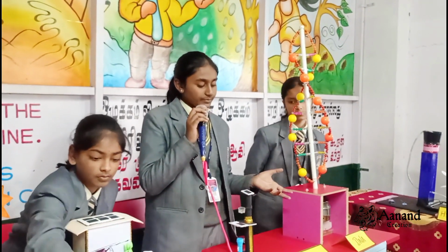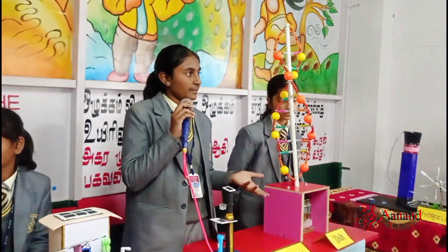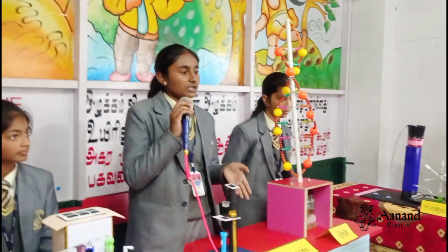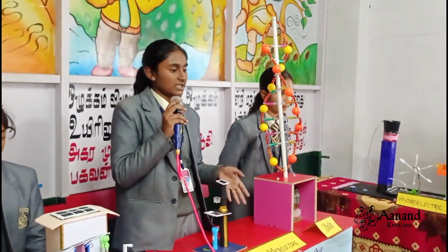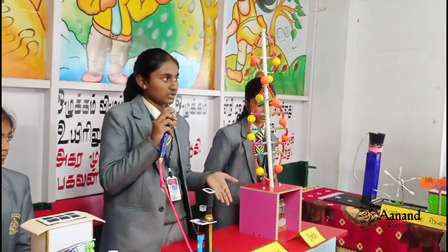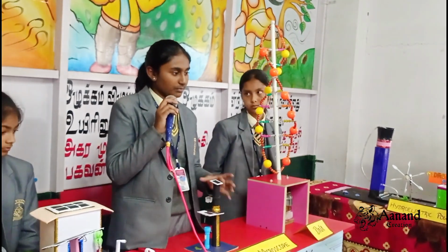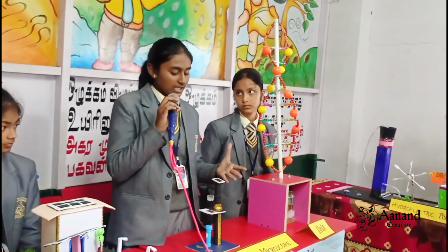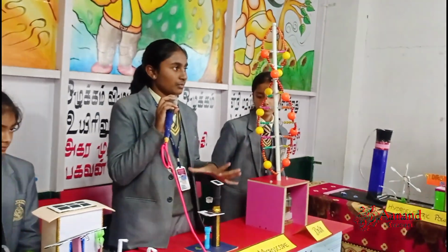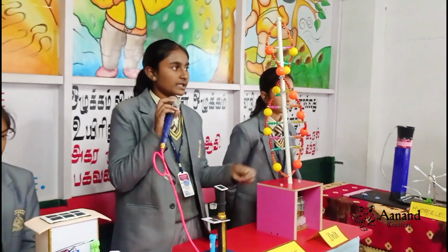There are two types of microscopes: homemade microscopes and new generation microscopes. In the new generation microscopes, there are many buttons and switches which are not that useful. But in a handmade microscope, the only important part is the moving lens part. The lens is the most important part of a microscope since it helps to magnify the object kept under it.